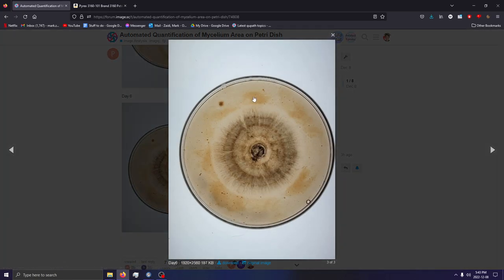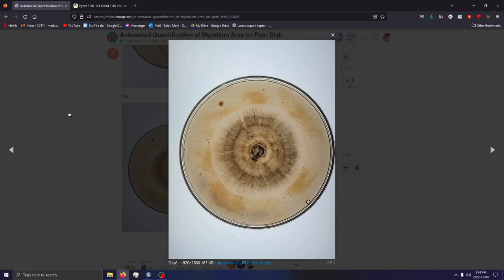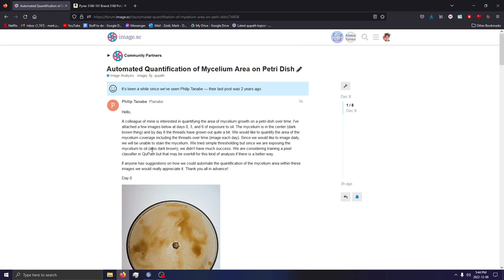To potentially separate the oily color from the mycelium. Fungi typically lack any kind of pigmentation, so mycelium, hyphae, and any chitinous structure will be white unless colored otherwise. If you have oil, both your background and your mycelium will be taking up that oil and consequently be positive for the same color vector, just at different luminance values. So the challenge is how to automate the quantification.